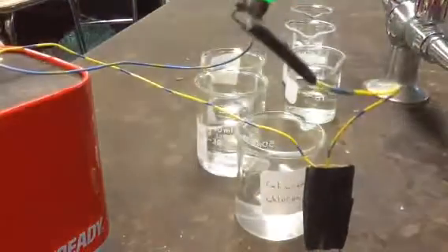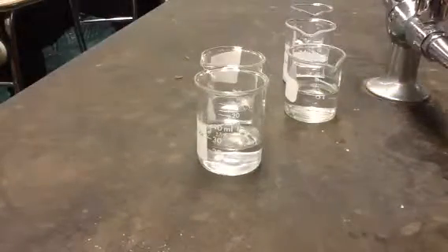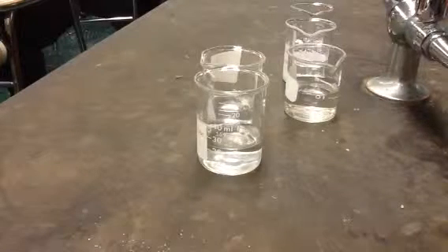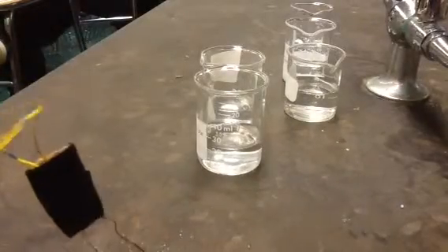Okay, so let's continue solution testing, and I'm going to rinse off my electrodes. So we say that calcium chloride is conductive. So we'll rinse off the probes with distilled water. Why don't we use tap water? It's got ions in it, potentially.